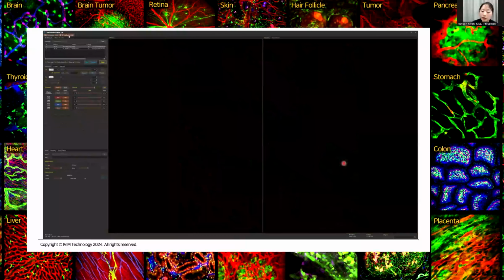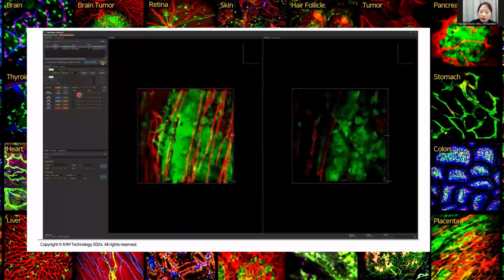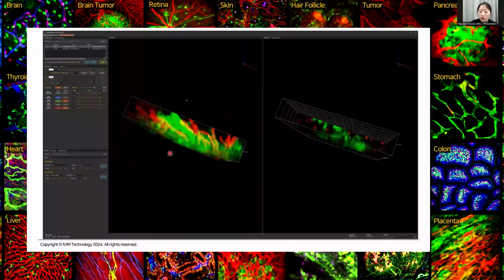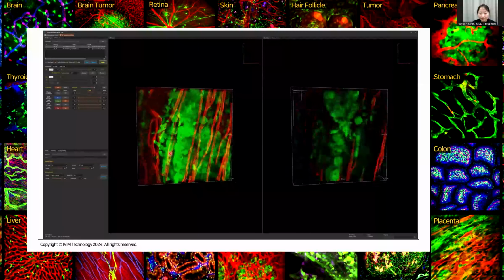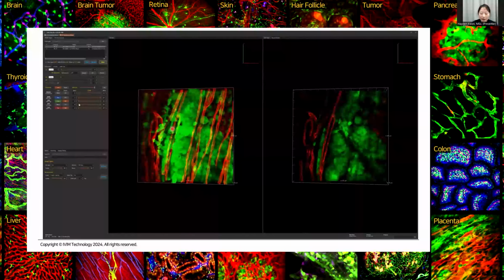Additionally, we can utilize the depth-wise acquired data sets for 3D reconstruction. Go to the 3D visualization mode and add the folder again. Double click to open the selected data to build a 3D reconstructed image. Here I'm just hand rotating the images.